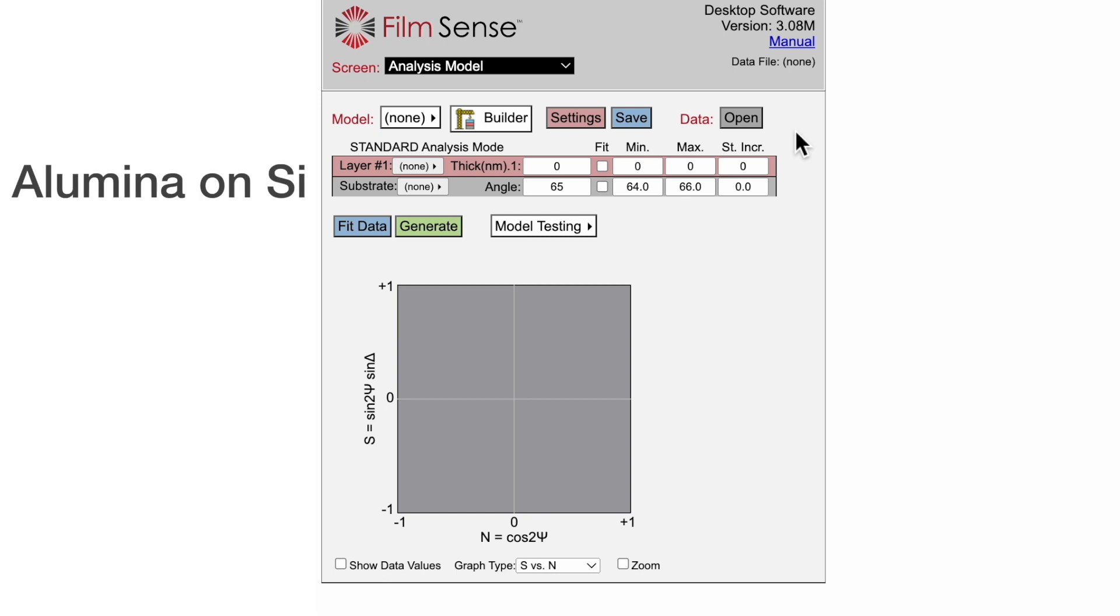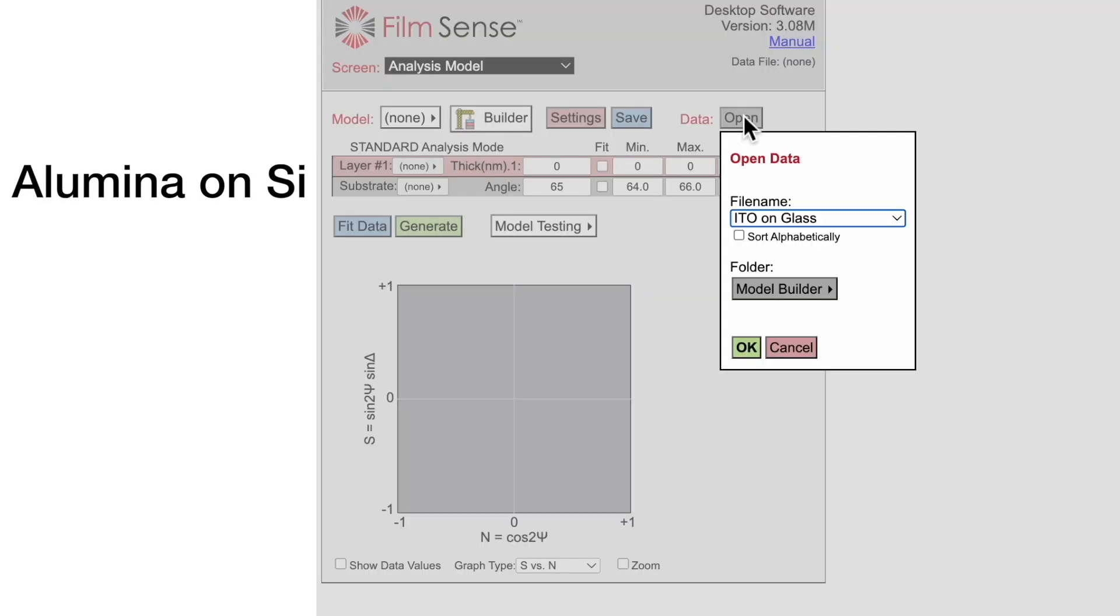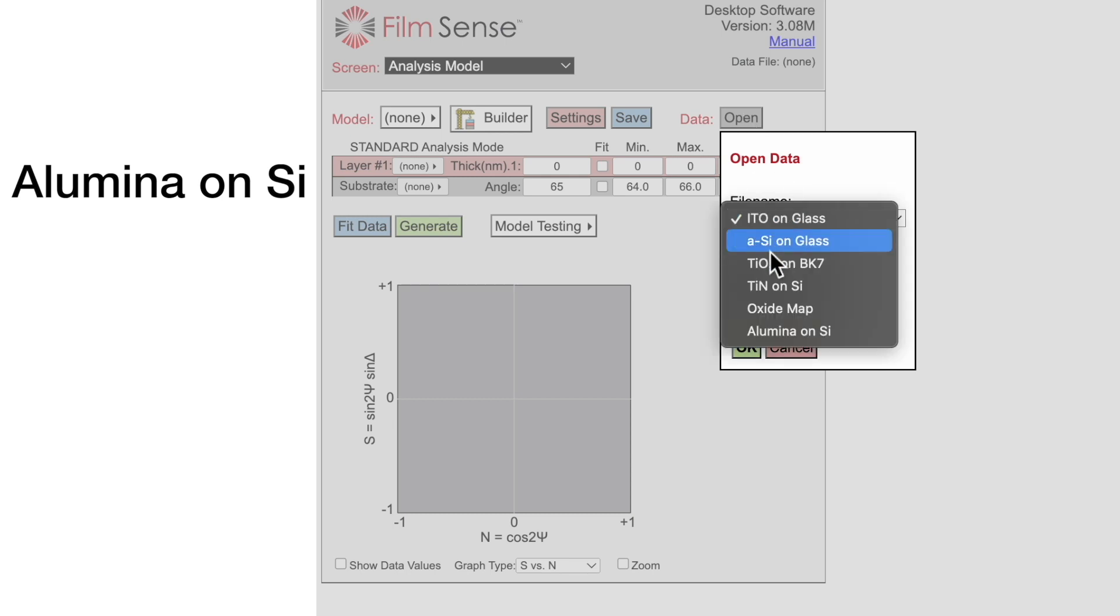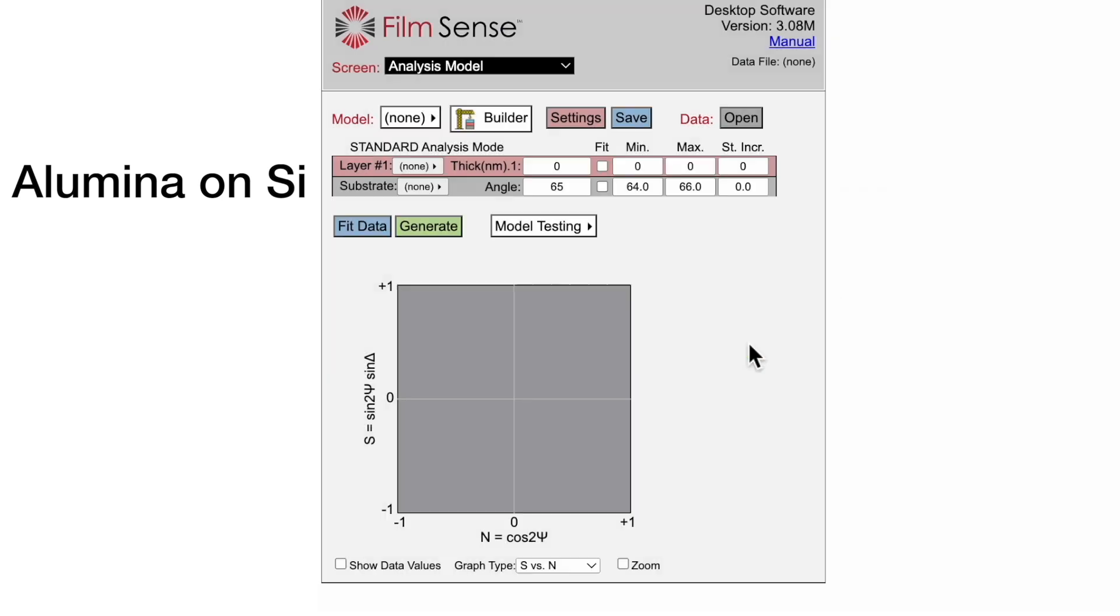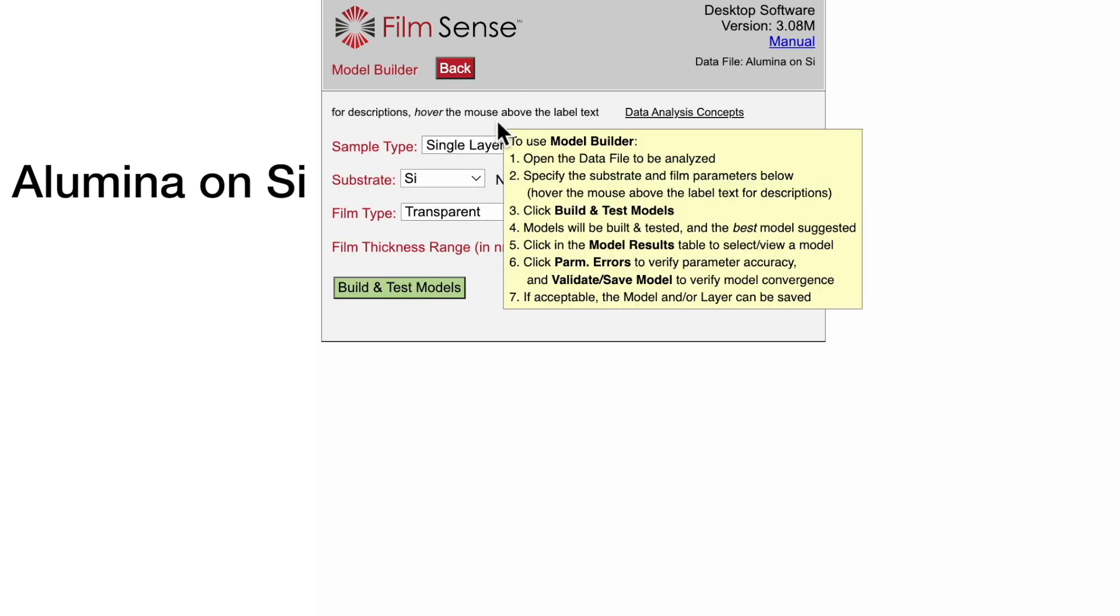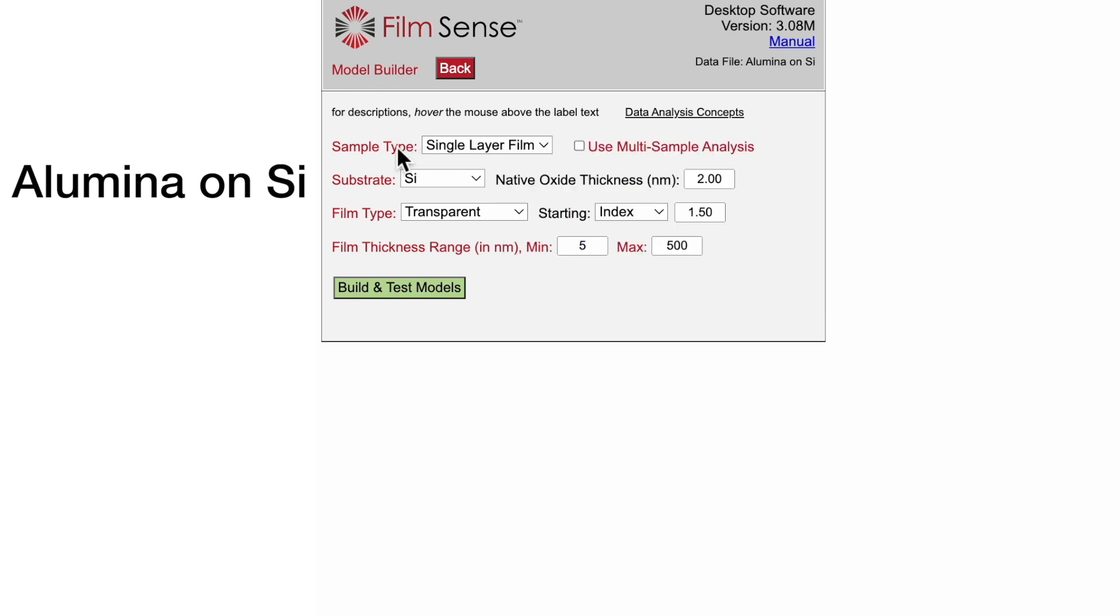For the first example, we will analyze ellipsometric data acquired on a transparent alumina film deposited on a silicon substrate. Click the Builder button to switch to the Model Builder screen. Model Builder is self-documenting. Hover the mouse to see detailed descriptions of the various settings.